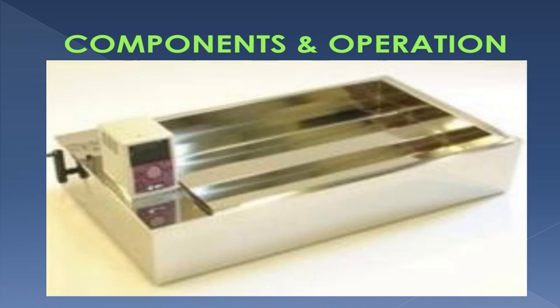Bottles are at an angle of about 20 degrees. Each Inspissator has 2 water heaters, 1.5 kilowatt each, running at 220 volts. Two spare heaters are additionally provided for emergency use in case of failure of one of the working heaters during the working of the inspissator.